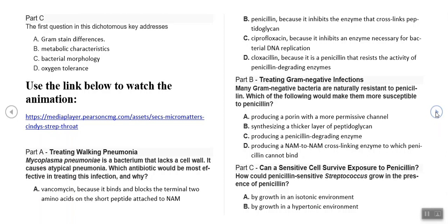In pretty much every microbiology class, you're going to have a project embedded in that class called your unknown, where your professor is going to give you a test tube and you're going to tell that professor, based on the gram staining process and the results from the biochemical tests that you perform on your bacteria, exactly what that bacteria is. You're going to build your own chart, your own dichotomous key.